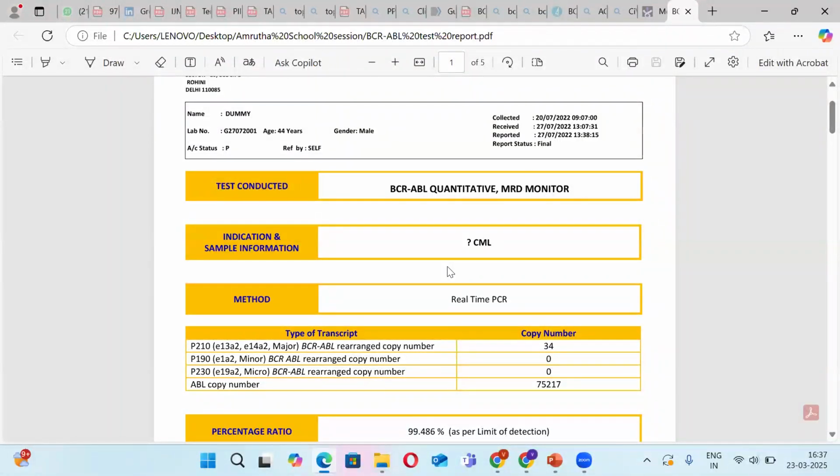It is like some other patients, ideally some CML patients, an ideal blood sample. It's important to run that to compare with the remaining patients which you're running in the batch. When you do the correction factor, whether you ran the sample today here, or in some other lab across India or the rest of the world, your percentage is not going to change.